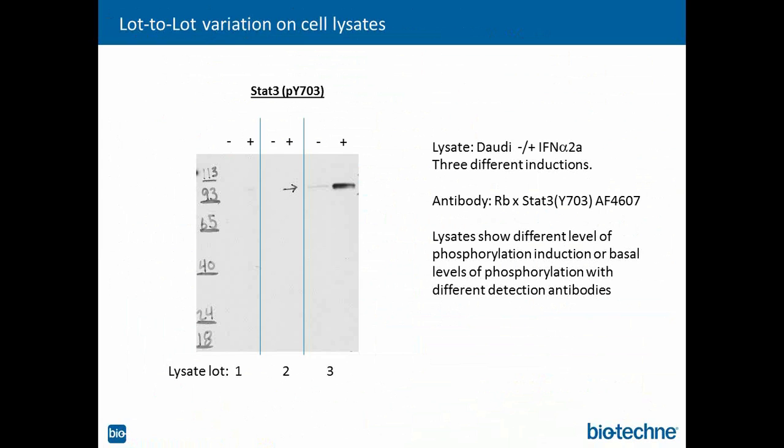And we used this to really make sure that our protocols on the lysate preparations are very, very robust. And I'm just showing you this as an example of what you can expect if you are not careful on lysate preparations and you're not training people according to protocols, or the protocols aren't very detailed.